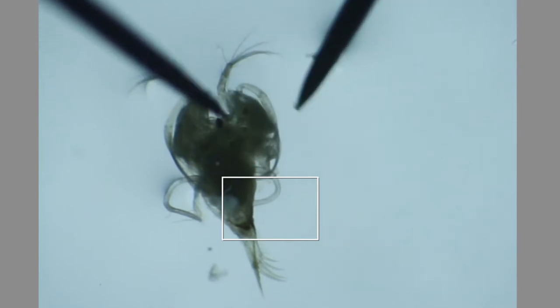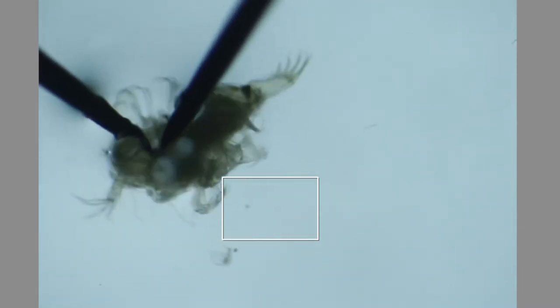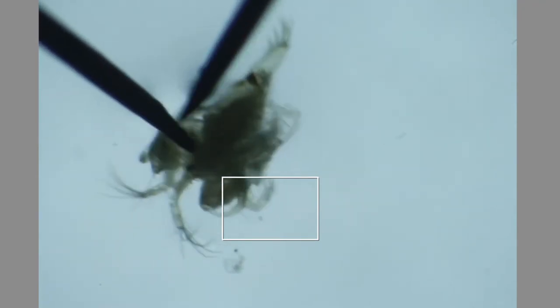The idea in dissection is that you want to get the limbs off as close to the body as possible. So I'm going to start here with the second antenna.